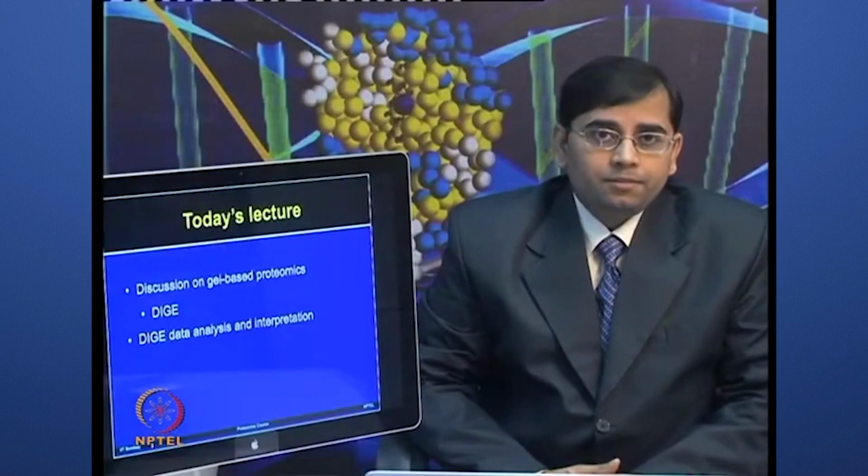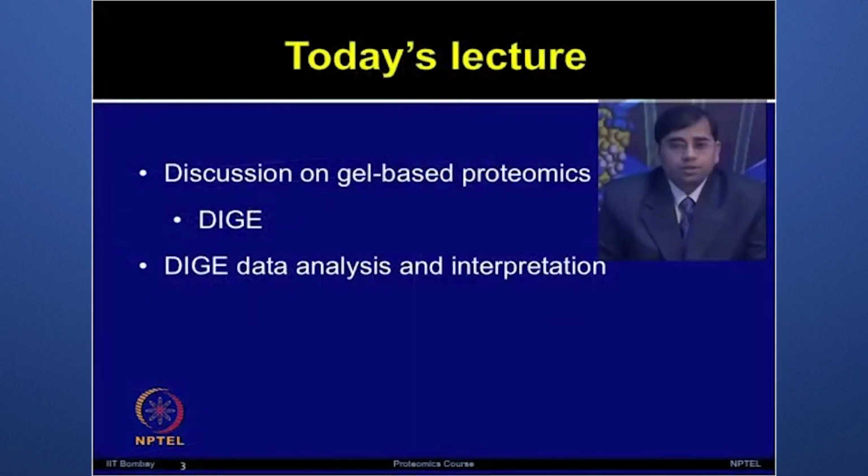In today's lecture, we will continue our discussion on gel-based proteomics, certain advantages and challenges of performing DIGE experiments, how to analyze DIGE data by using a few very specialized software, and how to interpret that data and obtain meaningful biological information from those analyses.